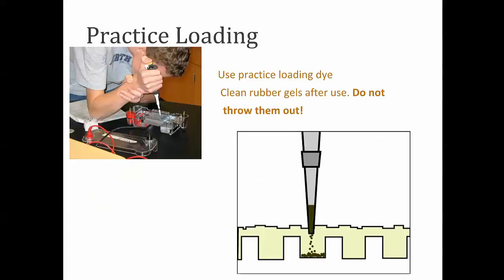So we're going to practice loading our gels today with some practice DNA and a rubber practice gel. And let me just emphasize when we do this, do not throw away your practice gel when you're done. They're very expensive. Thank you.